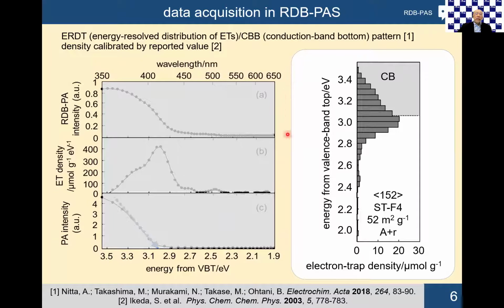The measurement system is something like this. This left top panel shows the actual photoacoustic signal change by scanning the wavelengths from longer wavelength side to shorter wavelength side.